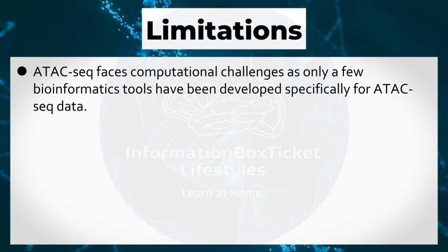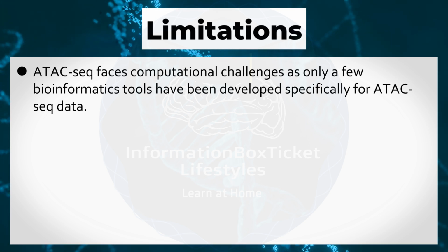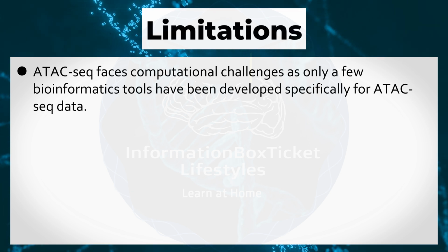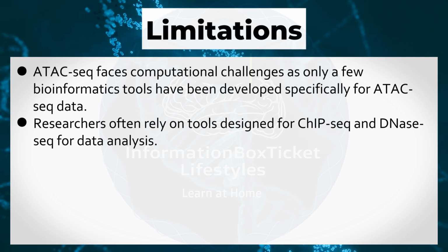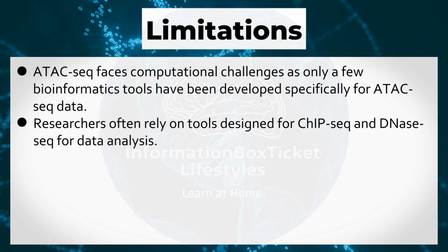ATAC-Seq faces computational challenges as only a few bioinformatics tools have been developed specifically for ATAC-Seq data. Researchers often rely on tools designed for chromatin immunoprecipitation sequencing and DNase I hypersensitive sites sequencing for data analysis.